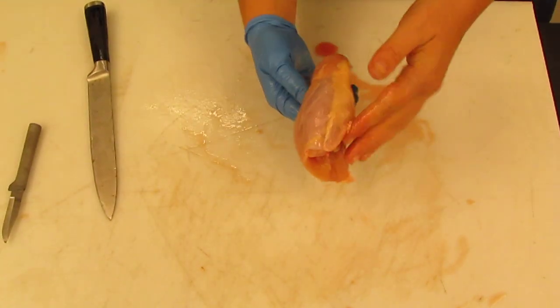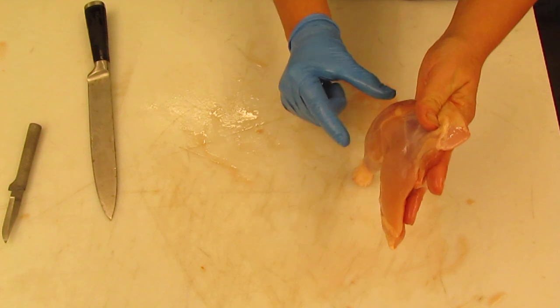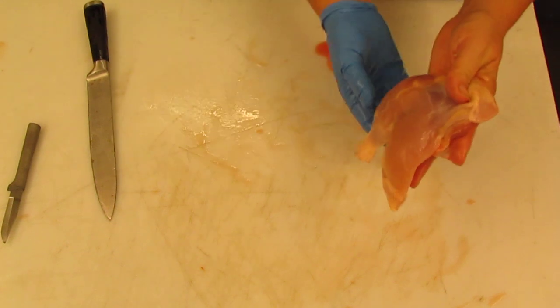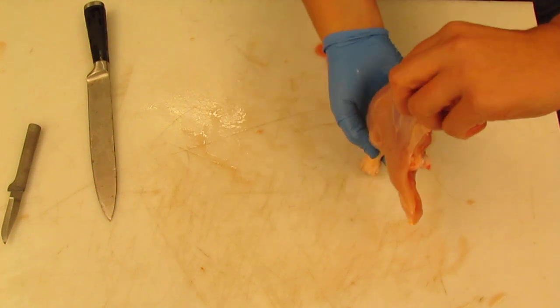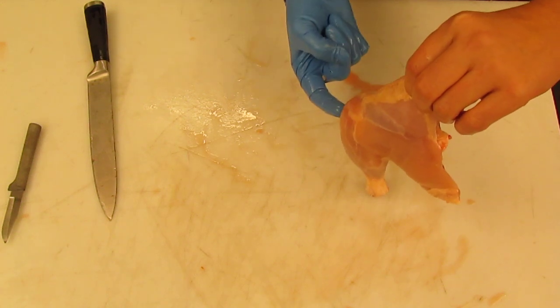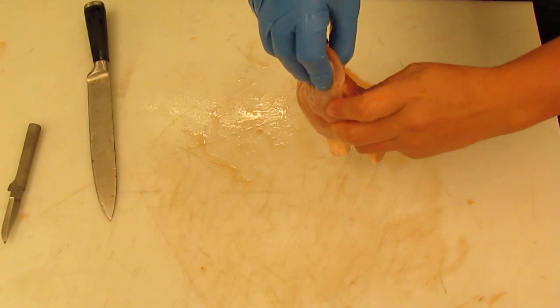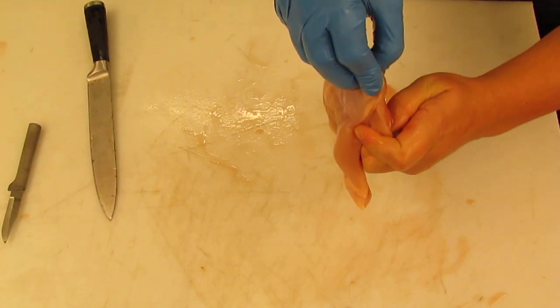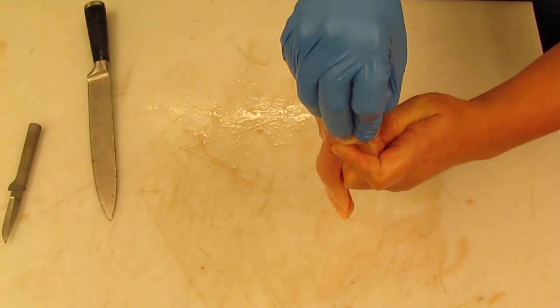Okay, so now, a little bit of orientation again. This is the knee, here's the thigh, here's the shin and the calf. Okay, so the next thing that we're going to look at are those muscles that we were just talking about. These muscles up here, with a little bit of the fat tissue, are inserting on the anterior side of the knee. And so when we pull on those muscles, if I can grab it right, we can see that the leg is going to kick out, right?